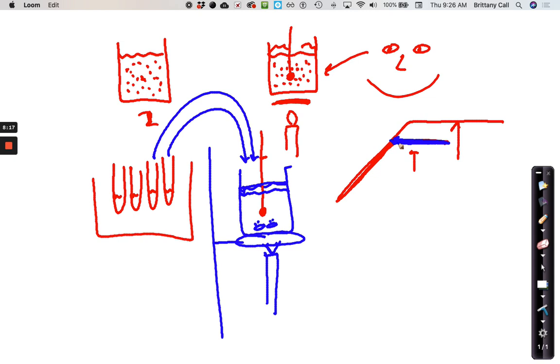Question? Are we recording it on this paper? You can record it on this paper, right? And you just write it in on there. Good. All right, we feeling good with that? Okay. Then once you're done, you've done all 5 trials, then we're ready for step 9.